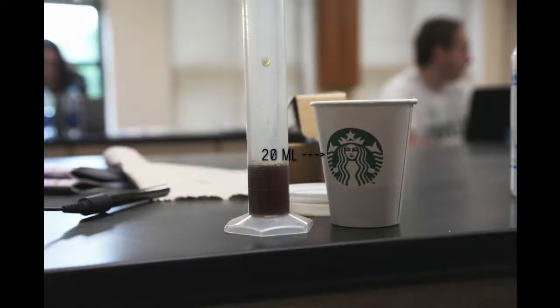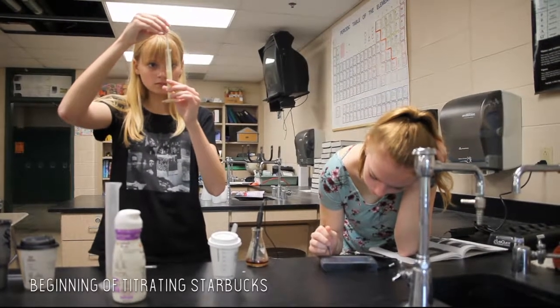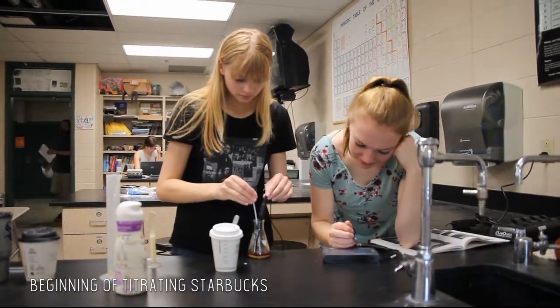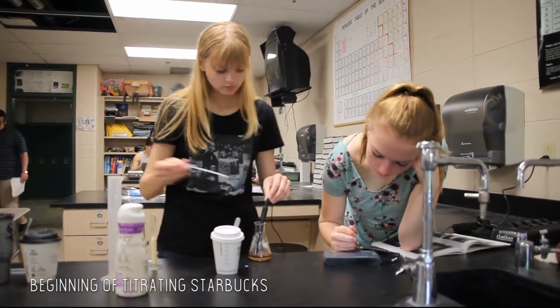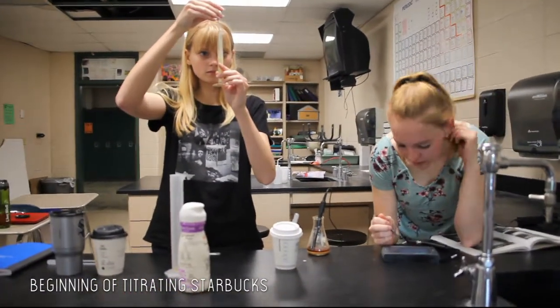Each trial, we titrated 20 milliliters of coffee with 12 milliliters of creamer and measured the pH before and after titration using the LabQuest. More specifically, to do our titration, we poured the black coffee — first using Starbucks — into a 100 milliliter graduated cylinder in order to measure out 20 milliliters, then poured that into an Erlenmeyer flask.